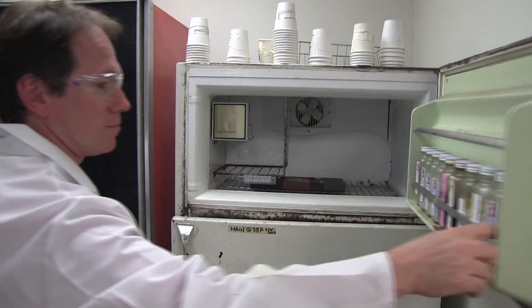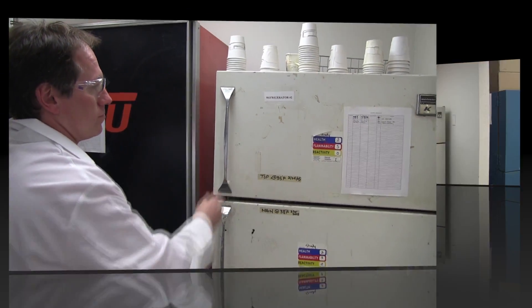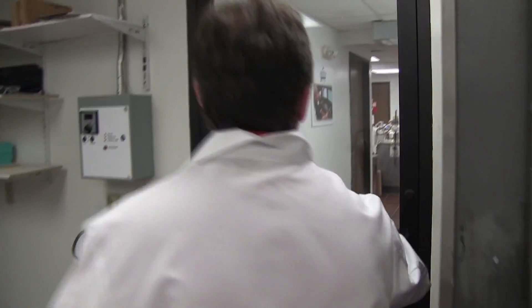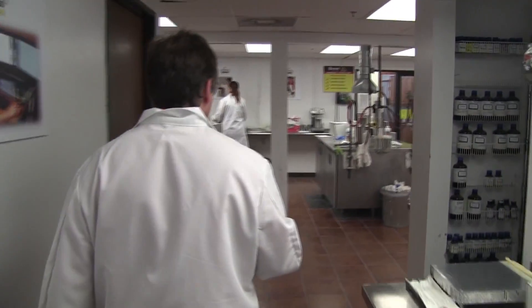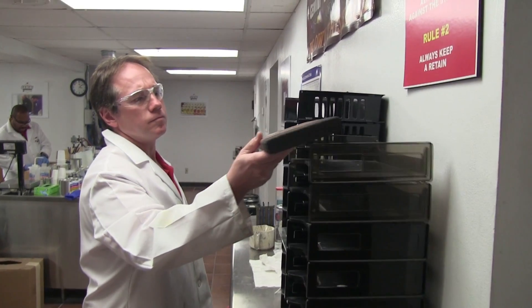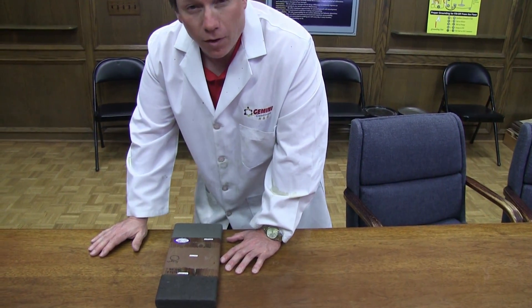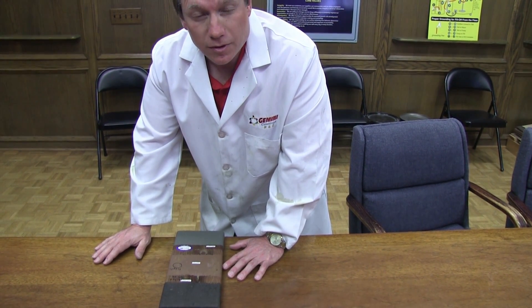The freezer is set at a constant temperature of 23 degrees Fahrenheit. After sitting in the freezer for 16 hours, we'll remove the panel and place it on the drying rack for four more hours. Then we'll repeat the entire cycle again for the designated amount of days.